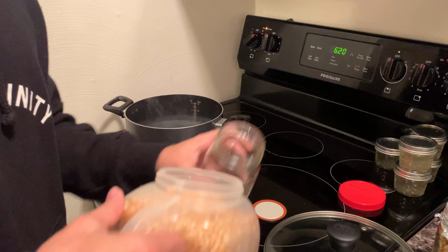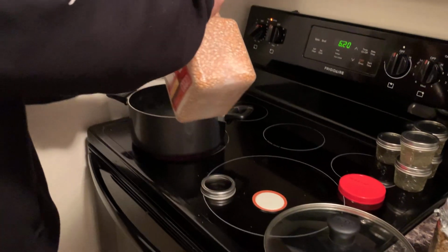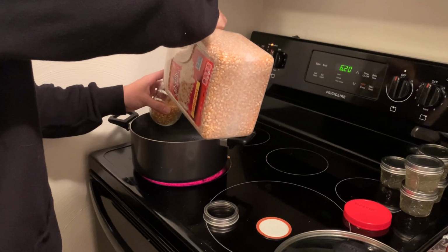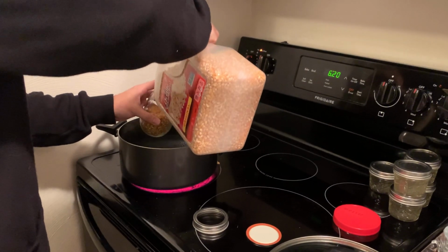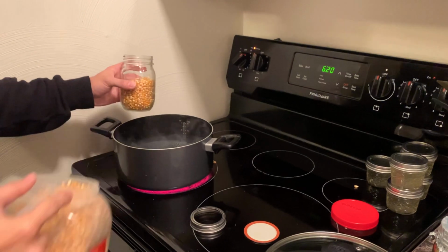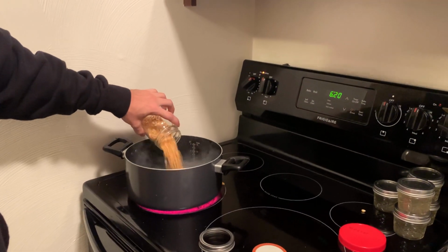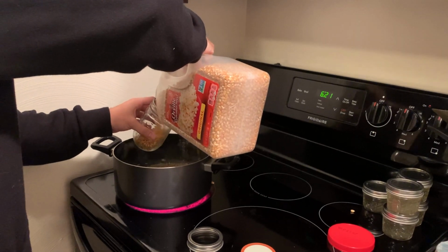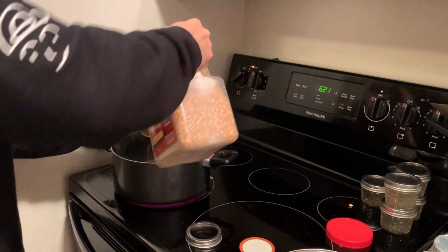And you're kind of just going to fill up as much popcorn as you need. I'm going to do 6 jars. And remember that these are going to grow, increase in size as they hydrate. So I'm probably going to do just over 5 half-full jars.